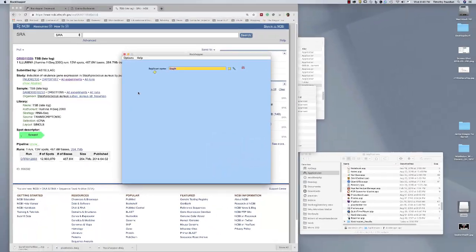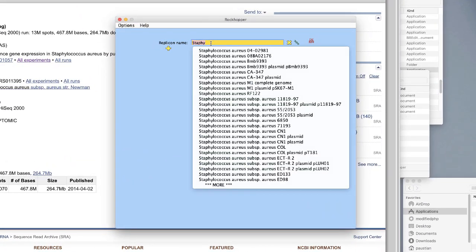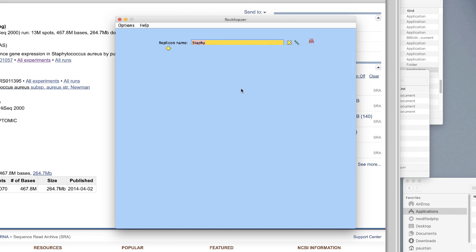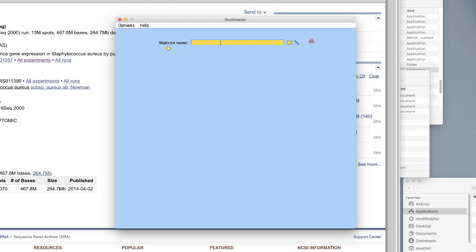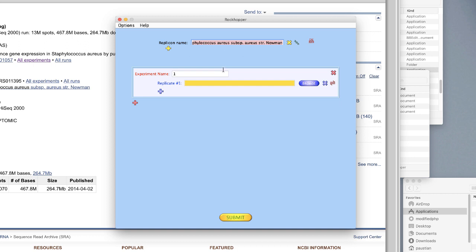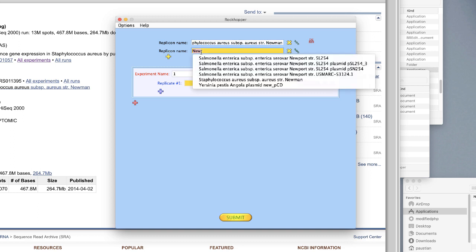That is the strain used in these experiments and the one we need to call up into RockHopper. So we'll switch to RockHopper and put in Staphylococcus aureus, subspecies aureus, and look for strain Newman. If we type 'Newman,' that works. You'll notice one irritating thing about RockHopper: if you type three letters it highlights, and every time you type a letter it does another search. There it is — replicon name: Staphylococcus aureus subspecies aureus strain Newman, single chromosome. With Rhodobacter sphaeroides it actually has two chromosomes and you have to bring both in for the replicon name.